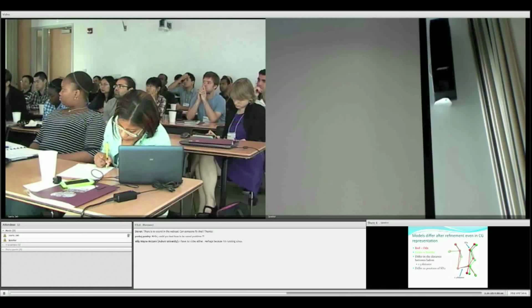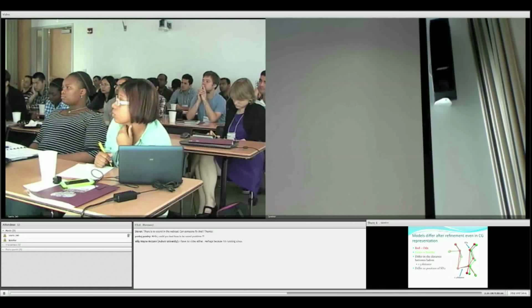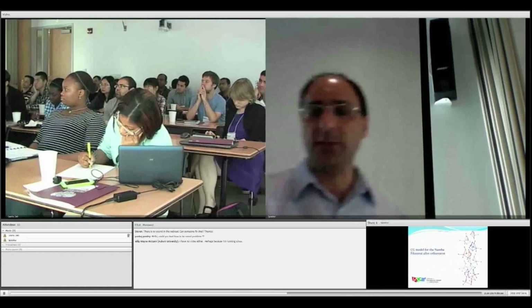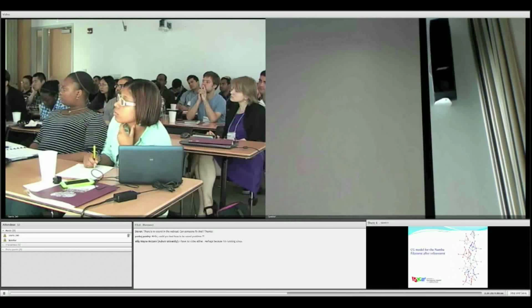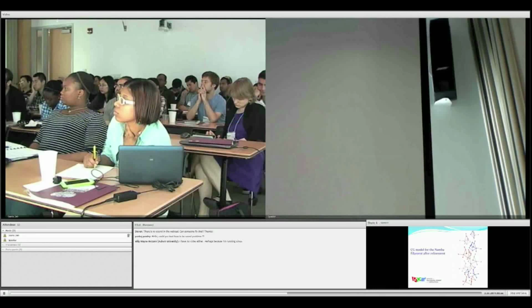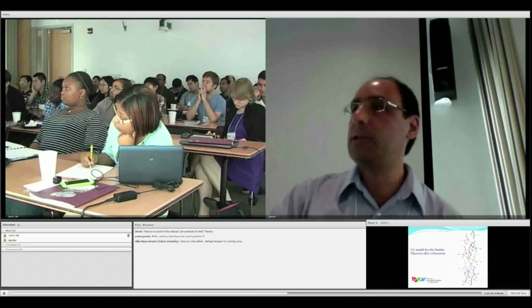For example, in subdomain 1, I gain lots of hydrogen bonds. The same thing between the subdomains: here again, 81 goes to 113, and 2 goes to 6.